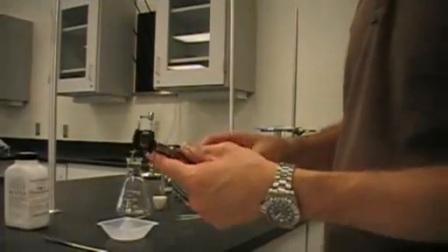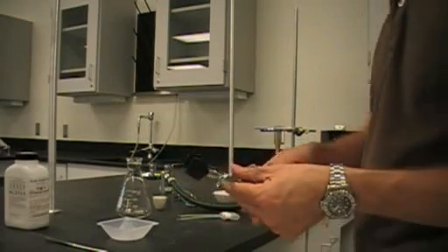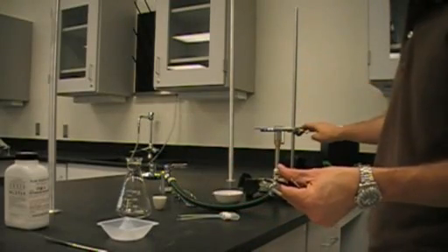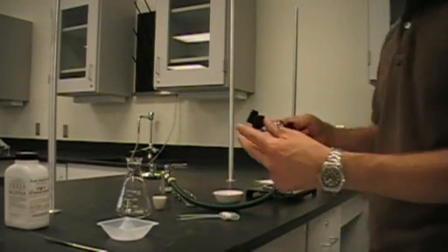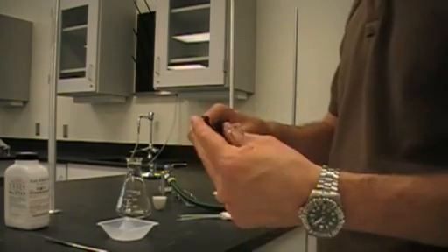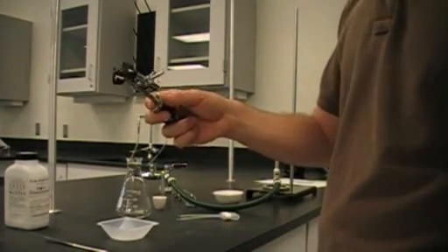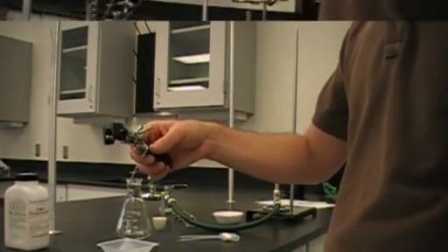The last piece of equipment that you need to see is a utility clamp. This is something that can get attached to the ring stand instead of the iron ring. And this can hold test tubes. It can hold syringes. It can hold kind of various things that need to be supported for either heating purposes.